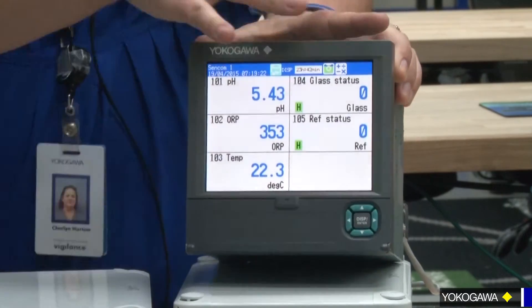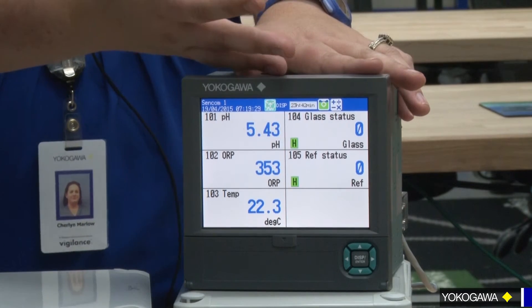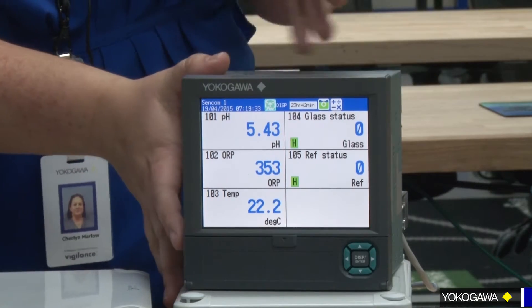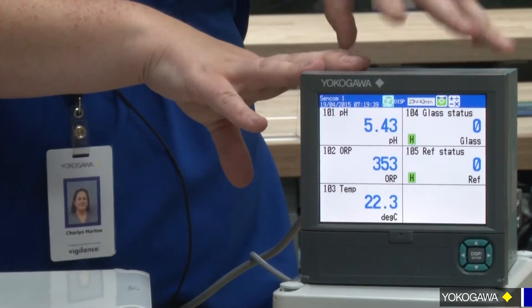You can either program it yourself — if you're familiar with these recorders already and have them at site location, since it's Modbus you just tell it what register to look at and you can program yourself — or we can do it here at the factory for you if you would like. That's the FX — that's the small one. Remember, you can only connect four sensors into one FX.